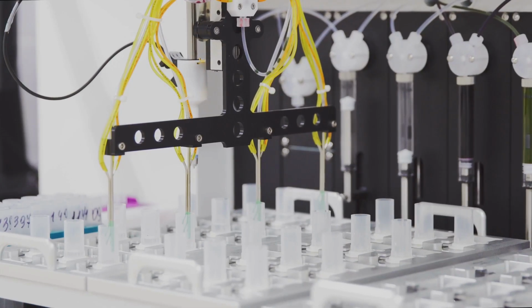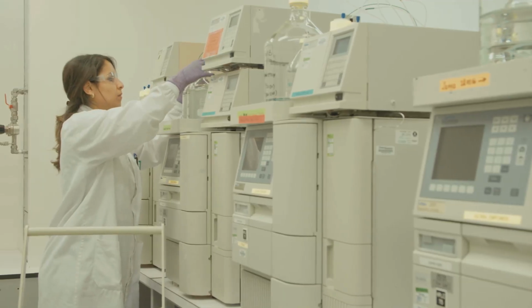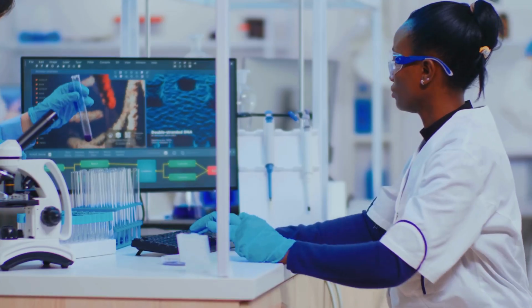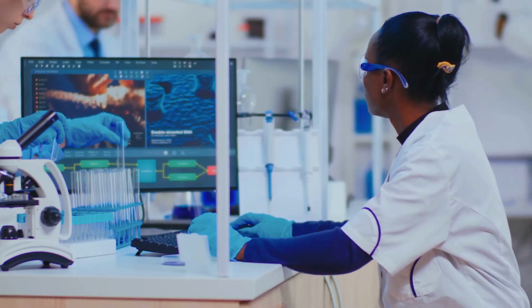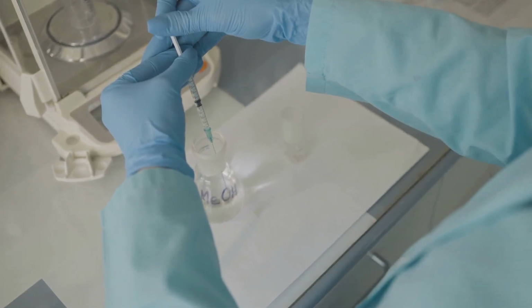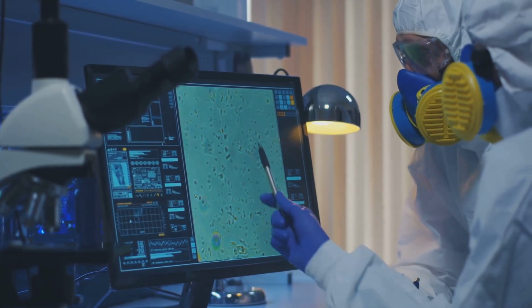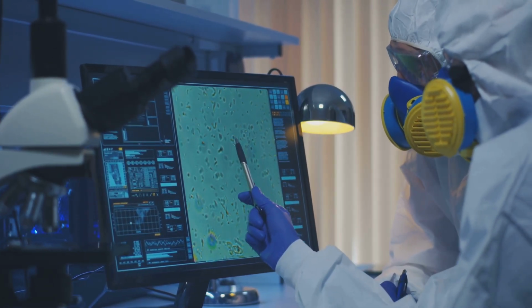Advanced tools: how to identify lipid peroxidation with LC-MS lipidomics. For researchers needing precision, LC-MS lipidomics provides molecule-level detail. It detects oxidized phospholipids and peroxylipid species with high accuracy. If your work involves lipid mechanisms or delivery systems, this is the most detailed approach to identifying which lipids were oxidized and to what extent.